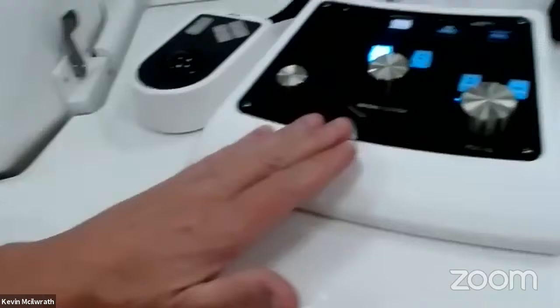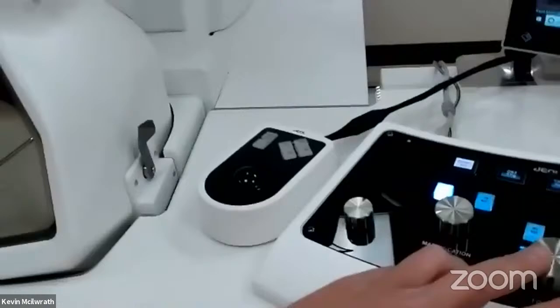The left panel on our microscopes controls the column above the objective lens. Our right panel here controls the lower part of the column with magnification, objective focus, and moving the beam. And then we have our trackball for moving the sample. And then we have our little PC right there with my drive. And our camera is down below here. So just to give you an idea of the hardware, I'll share my screen now.